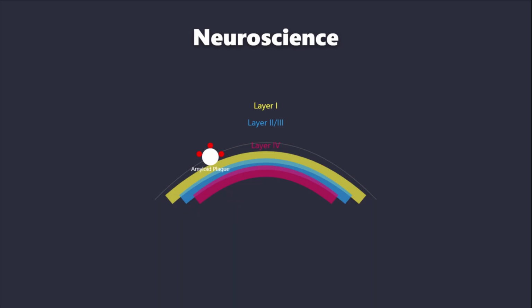The future trajectory of spatial transcriptomics involves integrating transcriptomic data with other spatial omics modalities. Spatial proteomics, utilizing techniques like imaging mass cytometry, maps protein abundance and post-translational modifications directly alongside ribonucleic acid measurements. Spatial metabolomics identifies the distribution of small molecules and metabolites within the tissue section.